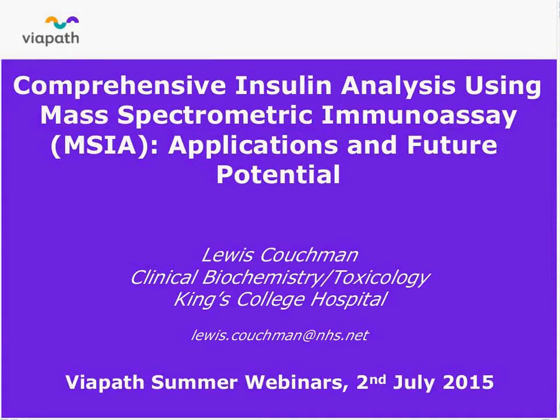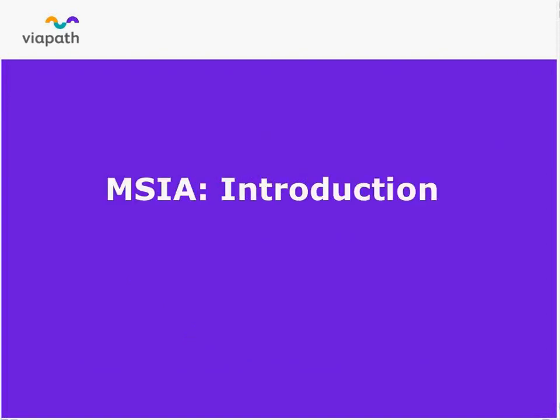Here we are. Okay. And just to reaffirm here, the actual title is Comprehensive Insulin Analysis, as you'll see, and we're collecting data using really high-resolution mass spectrometry, and that's really what makes the assay as comprehensive as you'll see that it is, and gives us the ability to look back over the data in retrospect to really get a good feel for what's happening with regard to insulin biochemistry.